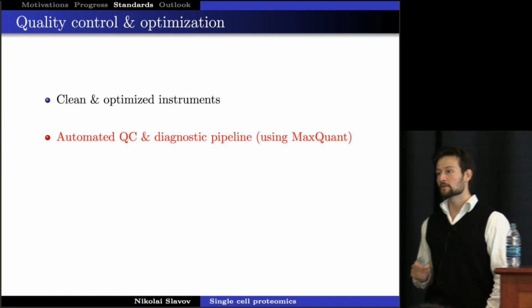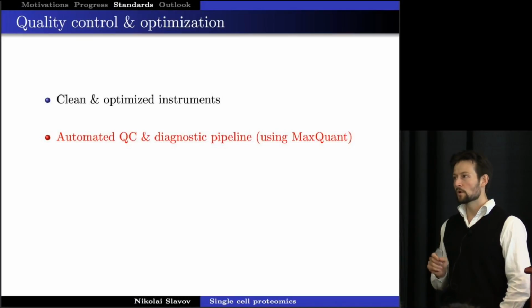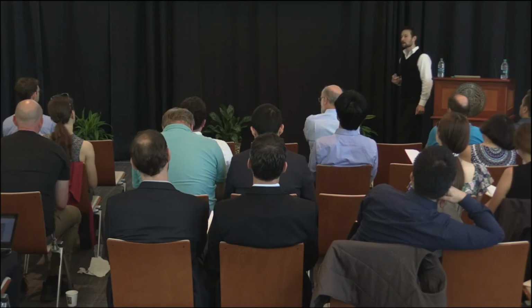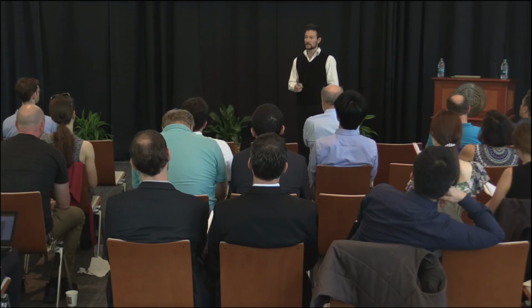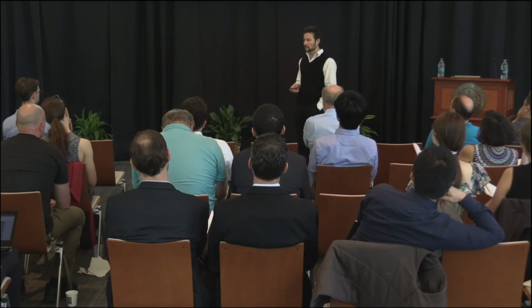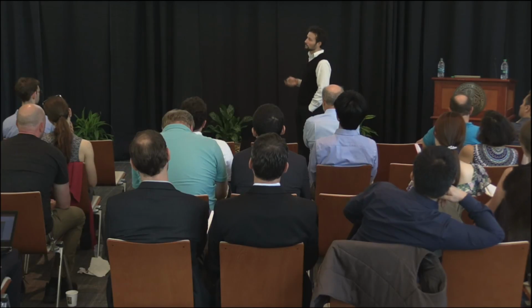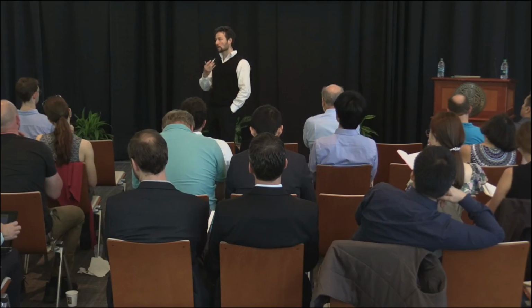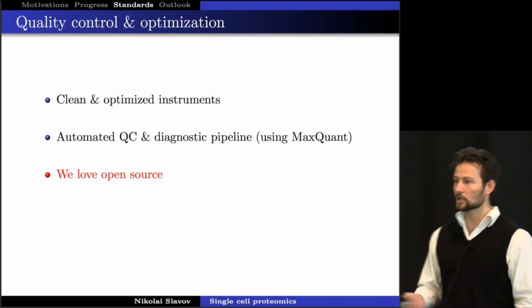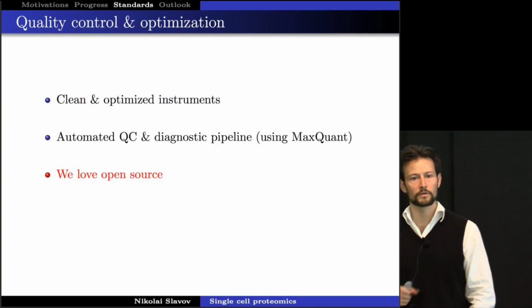And a lot of the credit for that really goes to the way MaxQuant, being open source, outputs a lot of intermediary information, not just the peptide levels and quantitation, but outputs all of the other ions that are very important. The other thing to say is that I love open source. So I'm very happy in looking at ways of incorporating what we have developed, what I mentioned in terms of using retention time in our specific context within a Bayesian framework, using the QC pipeline, using the other software that we're developing.